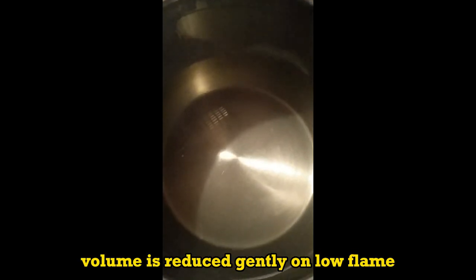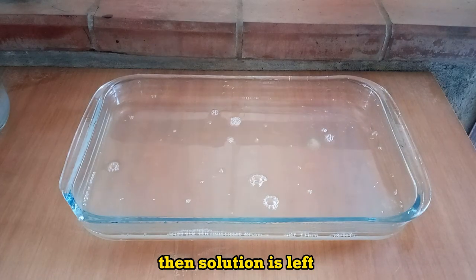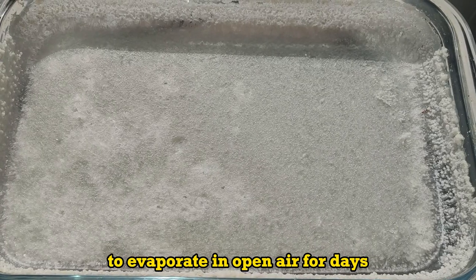Once finished, volume is reduced gently on low flame. Then the solution is left to evaporate in open air for days.